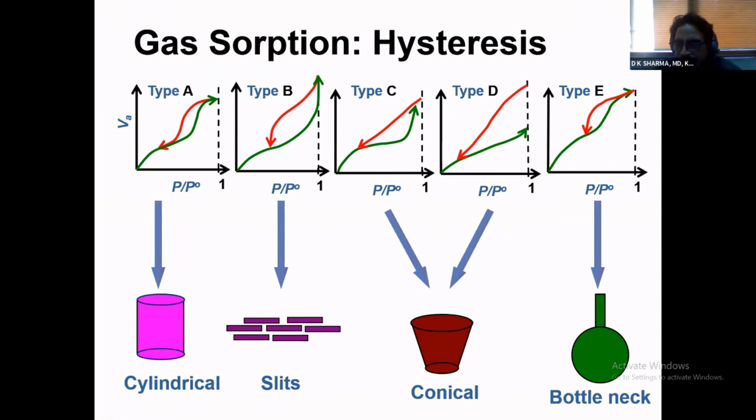In the gas adsorption, the smaller pores fill first. You know, when you start increasing pressure, at lower pressure, the smaller pores will fill. Okay. So when you are adsorbing at lower pressure, this pore has started filling because the neck is narrow. It has started filling at lower pressure, this pressure. And since it has got a bigger volume inside to fill, a lot of gas will keep on going there.